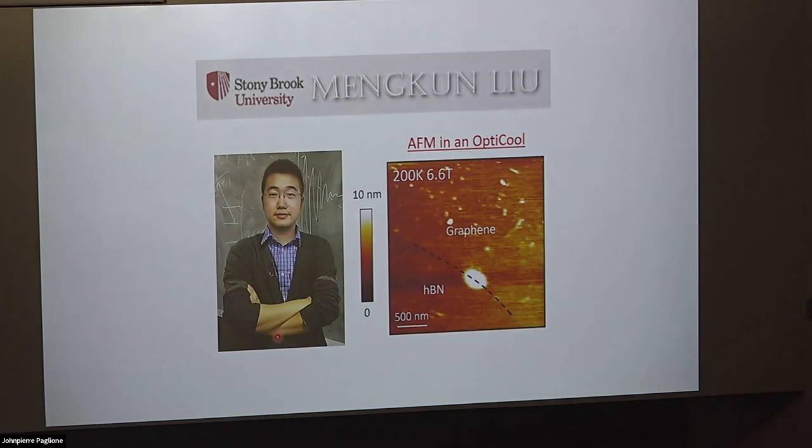They're also doing something I just learned about last week: Mengkun Liu at Stony Brook has put, and these are unpublished results, but he said I could show them. I'm not exactly sure what his end story is here, we have to wait for the paper, but we're excited about this. He put an atomic force microscope in his OptiCool and is doing AFM at 200 Kelvin and 6.6 Tesla. I think this is pretty neat and exciting.